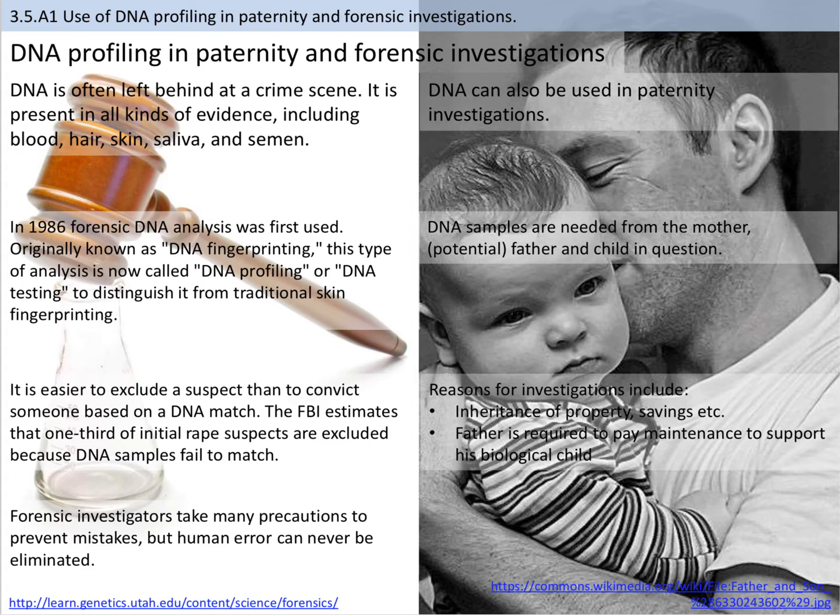But that can't be the only thing that we base our paternity test on, but it's something that has to be considered. And then we'd also look at just the results from the paternity test to determine if this person is the biological father based on our banding patterns. So now we can go through a couple practice problems to kind of show you what this would look like.